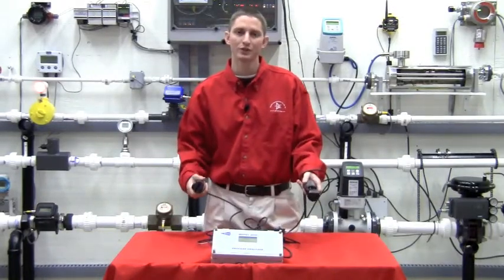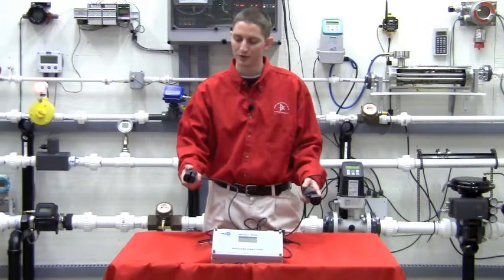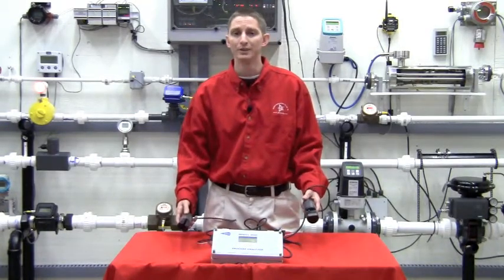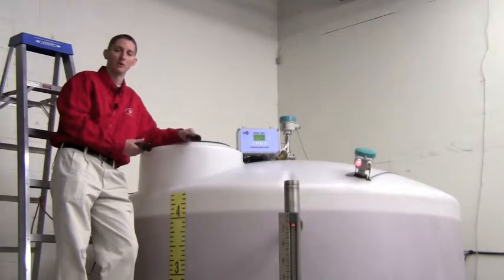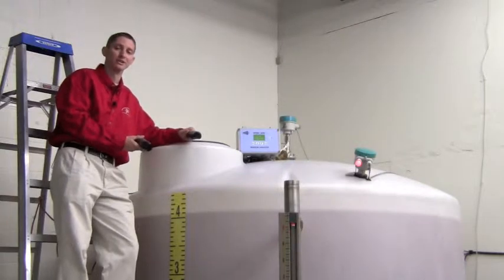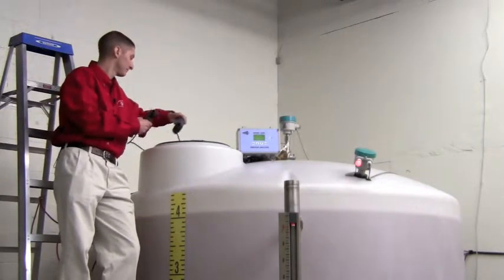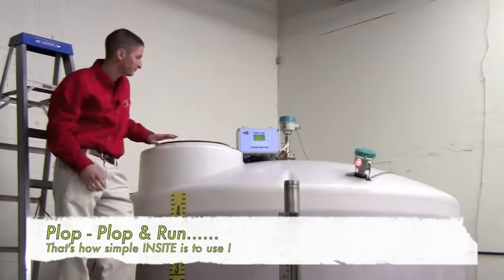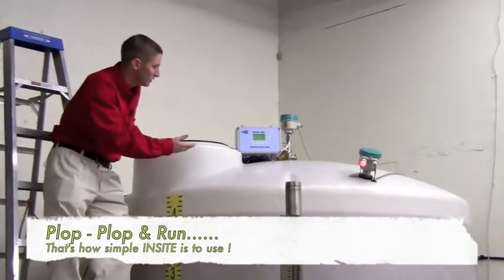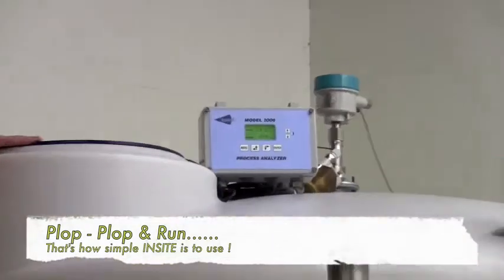We have a dissolved oxygen sensor and a total suspended solids sensor. I'll now show you how easy this process is. We've now provided power to this unit and wired up our sensors — and there you go, you now have a reading.